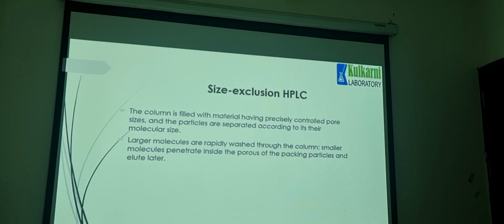Larger molecules are rapidly washed through the column. The particles which are larger will elute fast from that particular column.